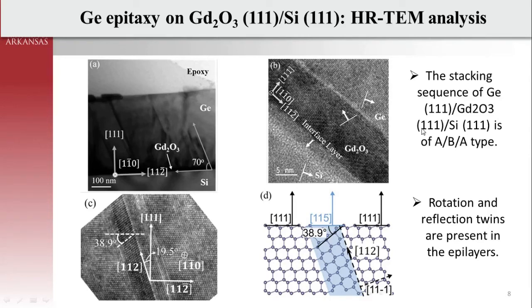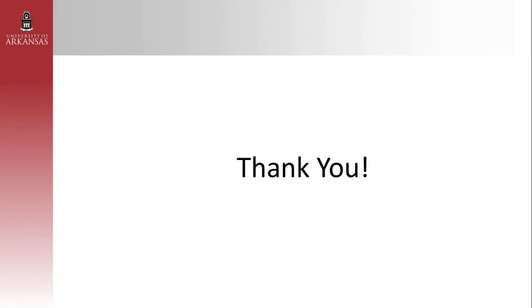By using TEM, as I said, I have done this TEM characterization first, and I checked the consistency of this result by using pole figure analysis. So yeah, that's it. With that, we come to the end of our talk.